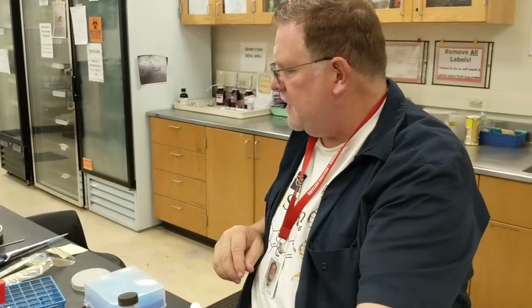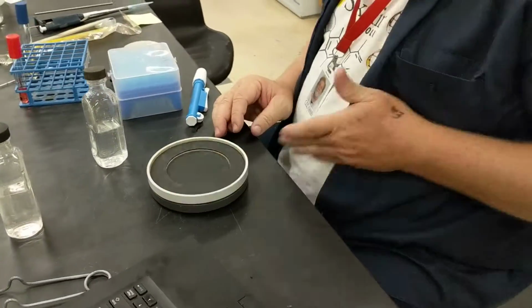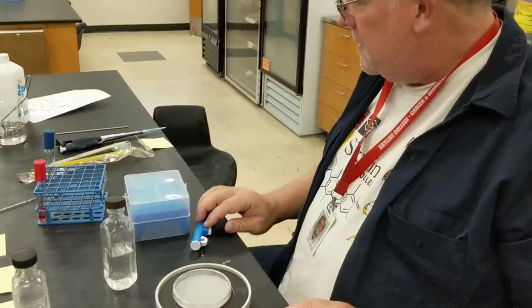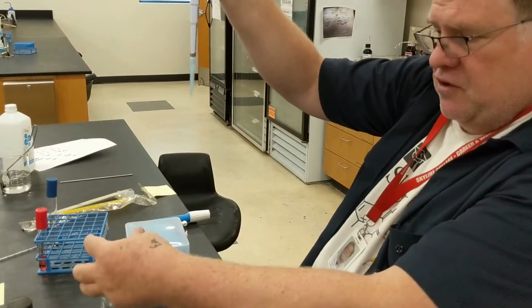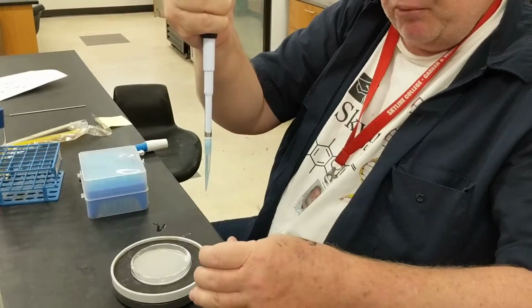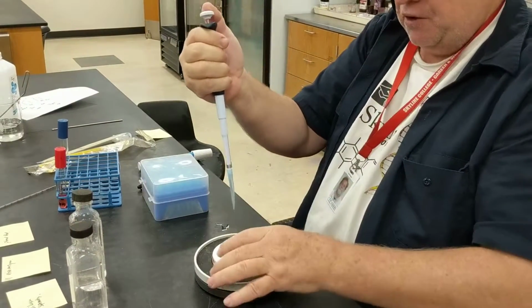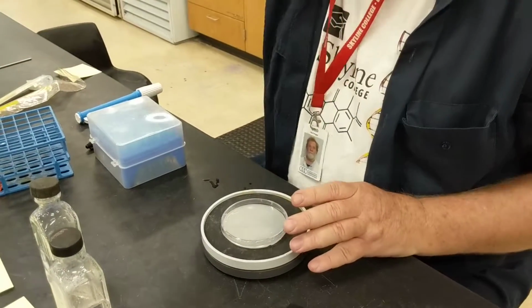The next thing I want to show is how we will count this. Again, I'll use some of the plates that we have. You're going to use a turntable, and it spins like this. You're going to put a Petri plate on there like this. Using a sterile tip, you're going to get your sample, and you would take up between 0.1 ml and 0.2 ml, and you would go ahead and put it on your plate. This tip would be disposed of properly.